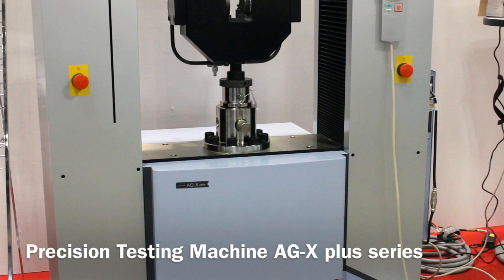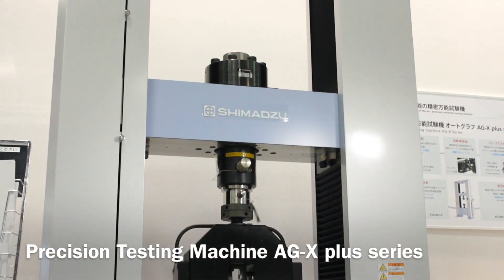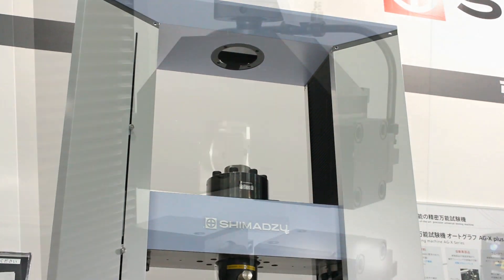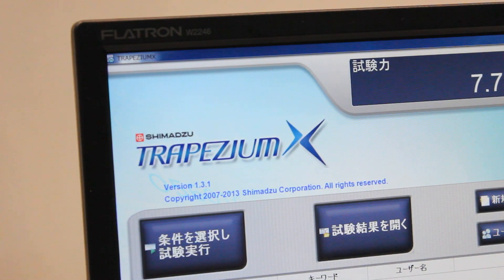The AGX Plus series is the flagship model of Shimadzu's material testing machines, which has the highest performance frame and cutting-edge software Trapezium X with an ultimate level of usability.